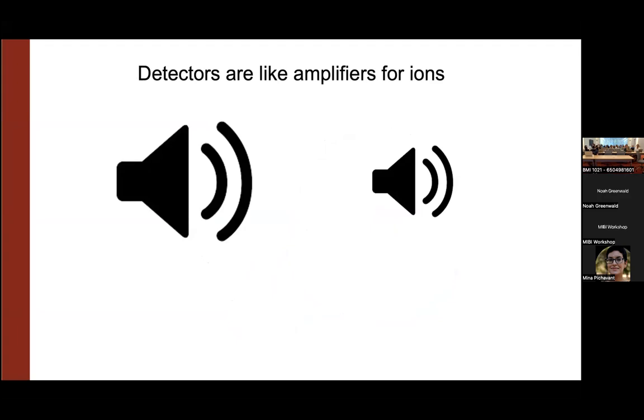So detectors are like amplifiers for ions. Why does this matter? You can think about changing the volume on your speaker, and the result is that it's going to increase or decrease what you hear in the output.